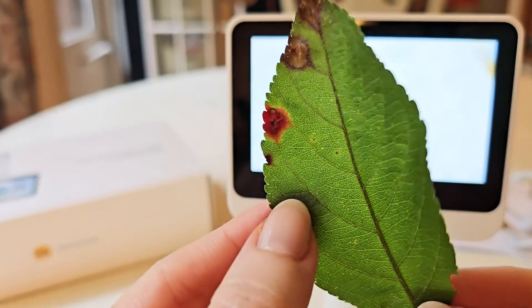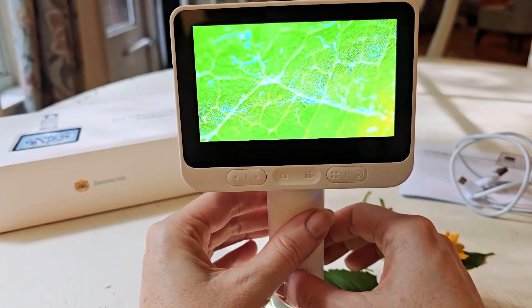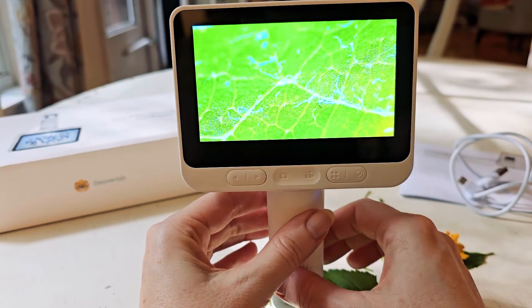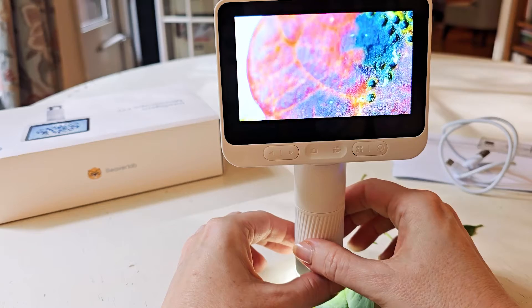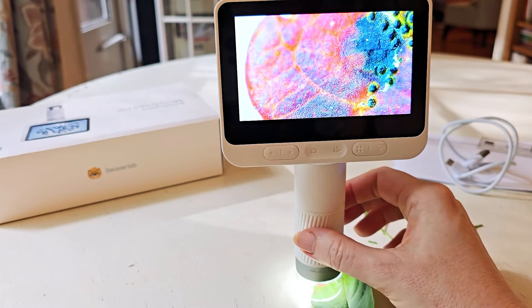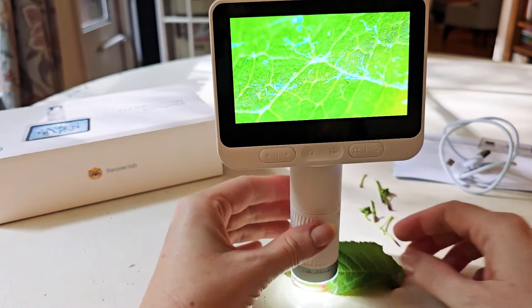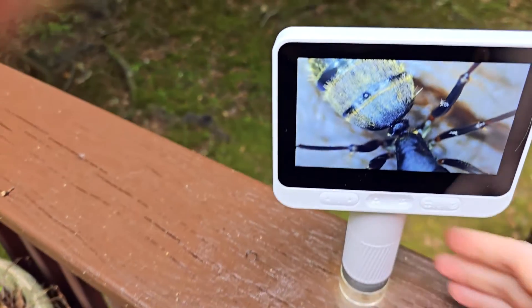I grabbed a leaf here — you can see there's a bit of damage to one side of it. I wanted to see it up close, so you can see the healthy green part and it definitely captures it clearly. And then — you might want to rewind this — there was a little tiny microscopic bug that went zooming across. It was really kind of amazing.